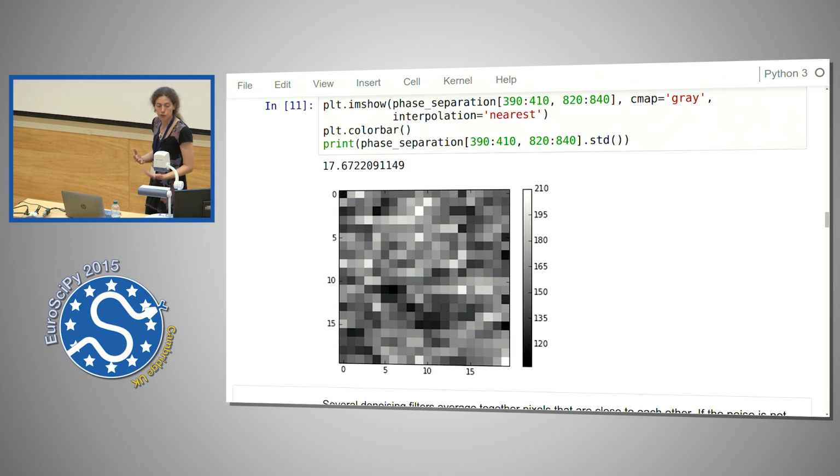And the source of noise in the image can be manifold. First, it can be something in your material that you didn't expect, but more often it can come from the acquisition process. That is, you can have a low counting noise if your exposure time is not long enough. You have that on your cell phone when you're taking photos at night, for example. You have a lot of noise on the image, but it can also come from electronic noise on the sensor that will add spurious values.